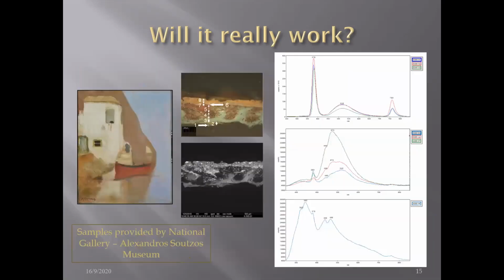Also, because as I told you, we had multiple painting layers. This is an example. There were 8 painting layers as were characterized by optical microscopy, and with the backscatter image of the SEM, most of those layers could not be as clearly identified.